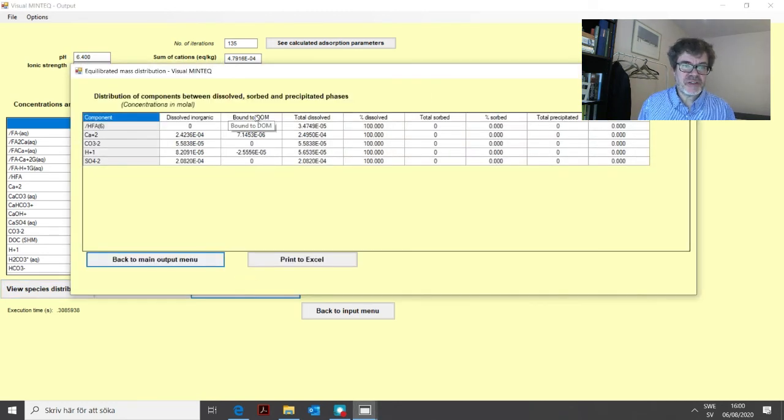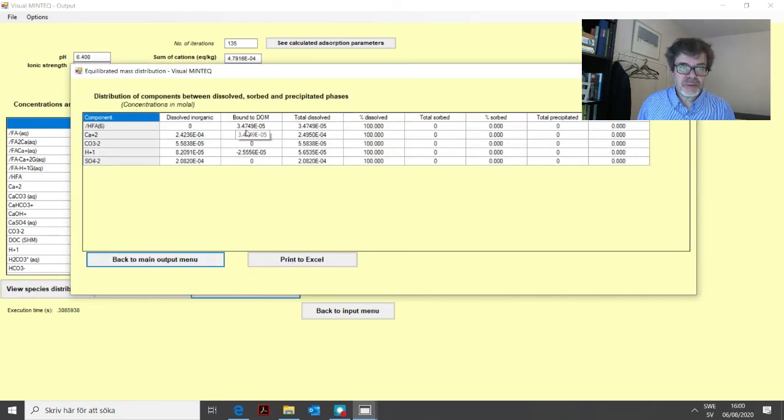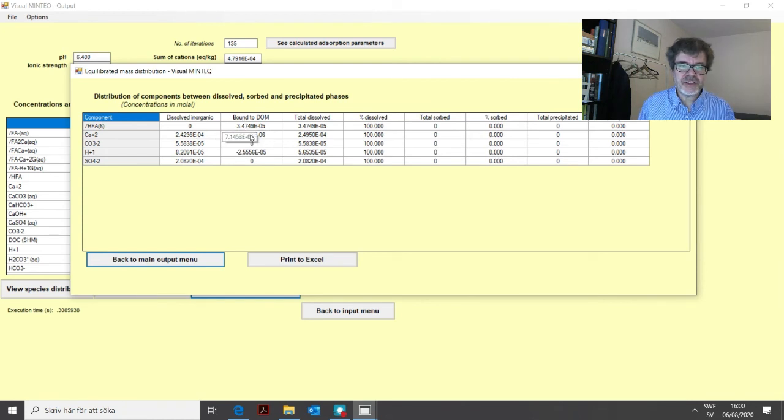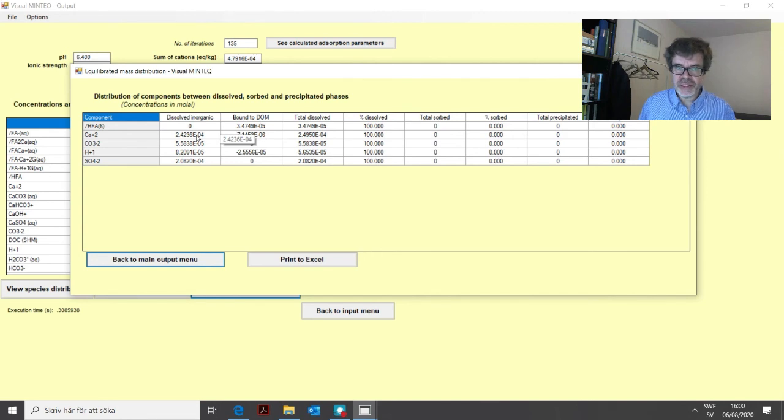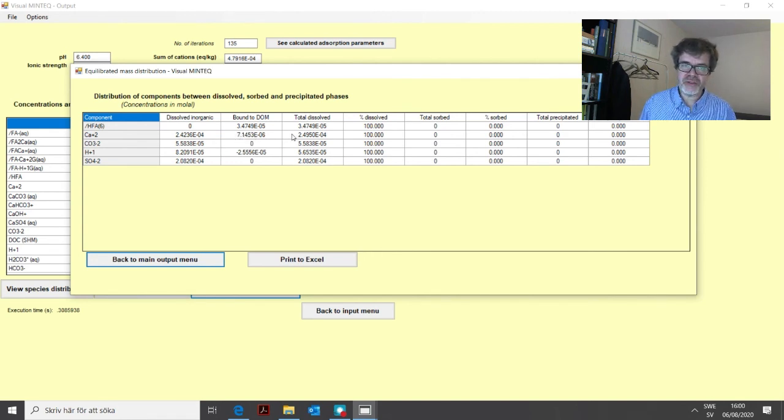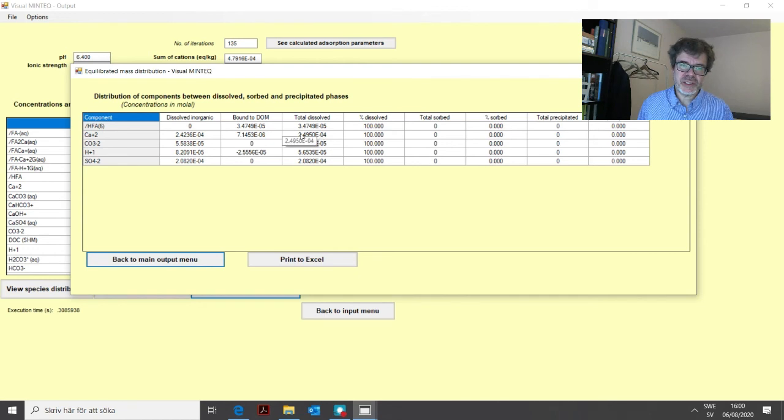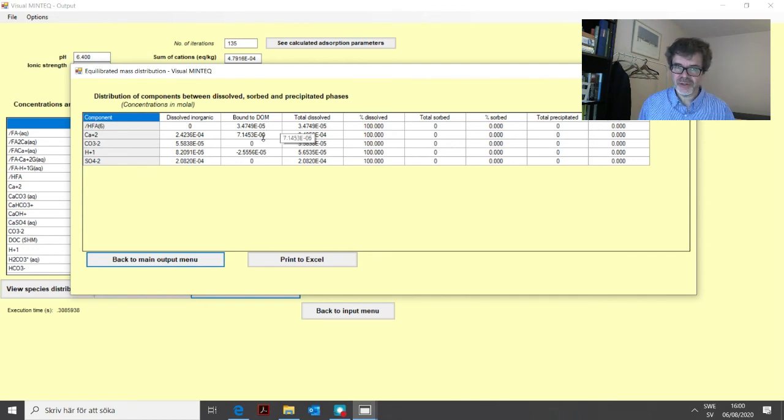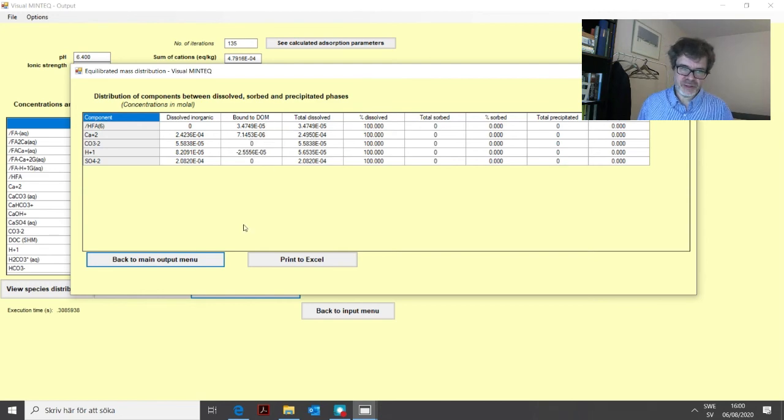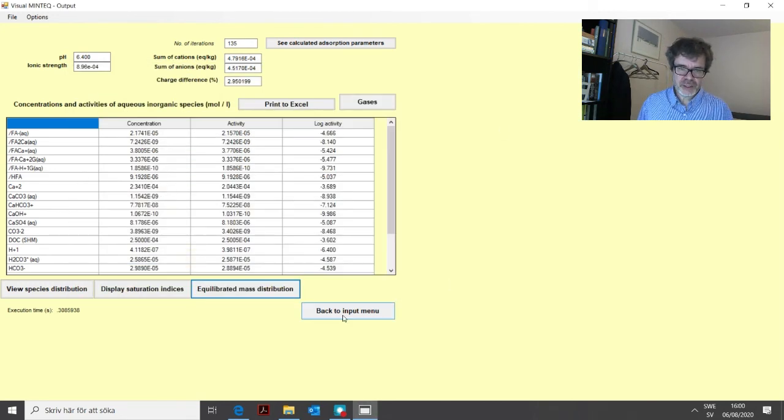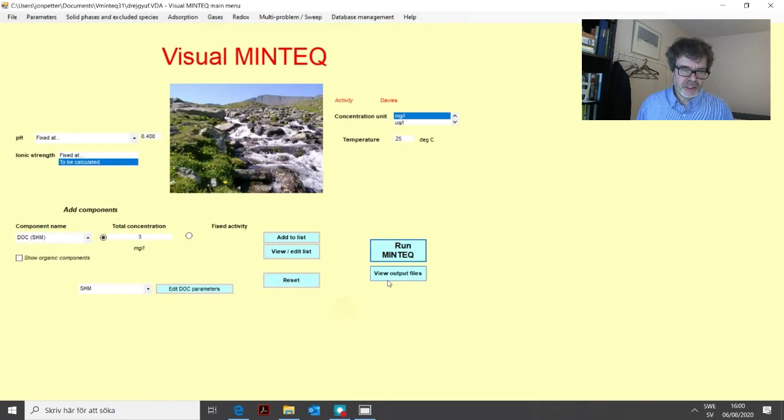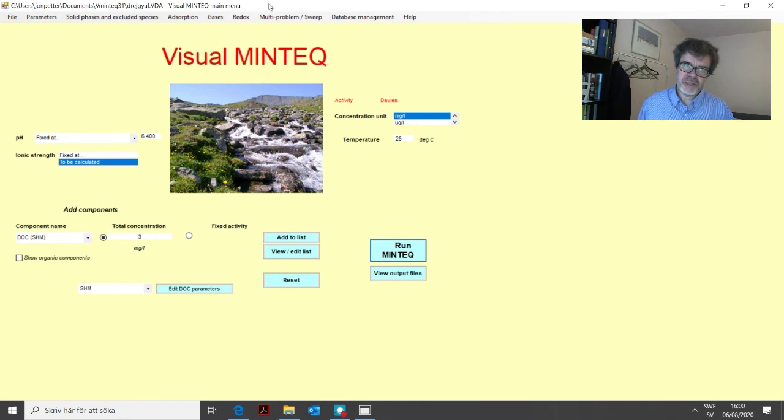So not a lot but calcium is not very strongly bound to organic matter in any case. So this percentage will be a lot higher for metals such as copper or lead. You can also look at one more thing, if we go to the equilibrated mass distribution the program has also separated out the part of calcium here that is bound to DOM from the inorganic forms of calcium. And so this is another way of just looking at how important this dissolved organic matter bound forms of calcium for example is. So now we go back. So that was the Stockholm Humic Model.